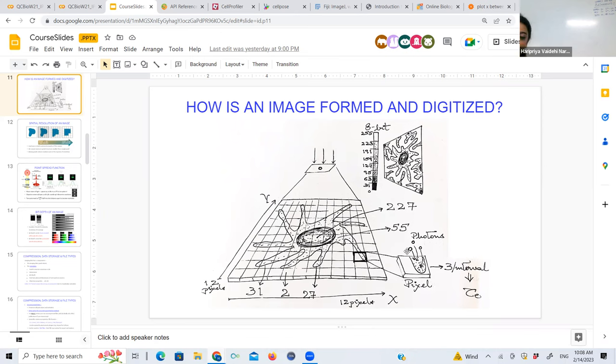And after that, it's very, very simple, right? If you count the number of light particles that reach each box within a certain period of exposure time, and you write it down as a number, that gives you an image. And what you do to actually get that nice little black and white picture is right here. You translate those numbers to a scale. And this is where the concept of a digital image comes in, right?